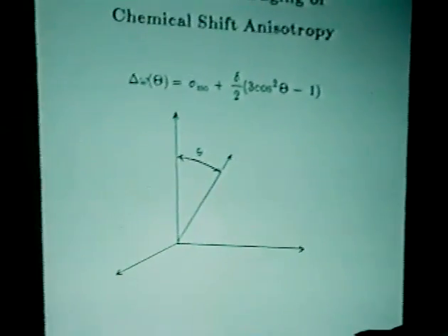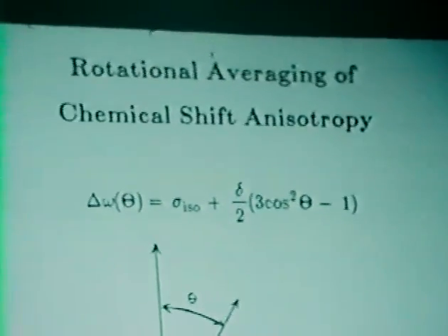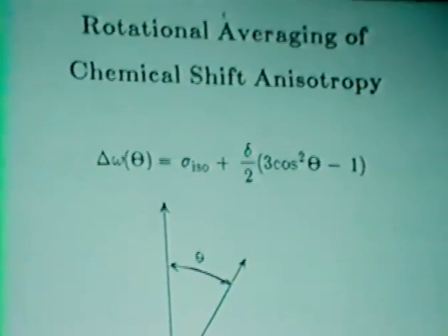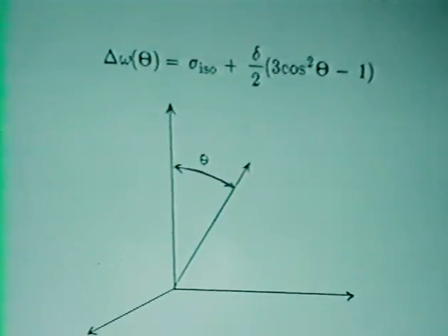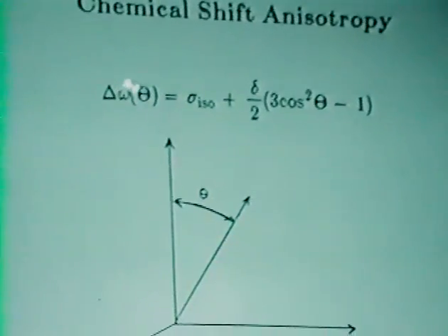Now, one final thing, I'll conclude with two more view graphs, and that is this. I'm going to make an exception here and talk a little bit about the technique of NMR because I think it's warranted. I want to narrow this line down, and I want to reduce it to its residual components. For this, I'm going to use something that's known as magic angle spinning, in which there's very little magic, but just some clever physics. And that is the width of these lines is a function of the orientation of each of these species, theta.